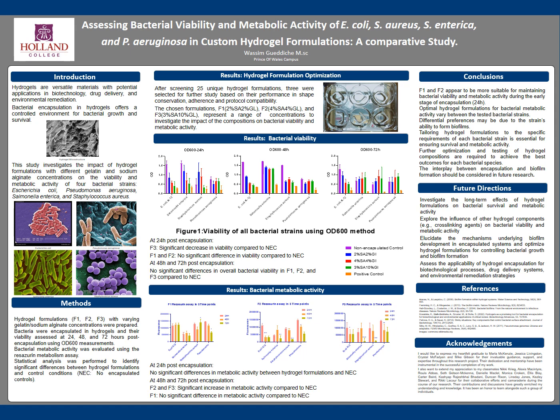I then narrowed them down to three based on their compatibility with the encapsulation protocol I used, which consists of submerging the hydrogel already mixed with bacteria in the cross-linking agent, calcium chloride in this case.